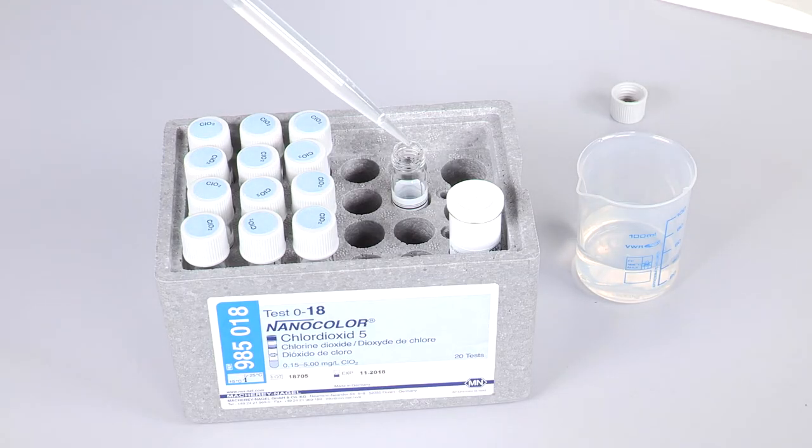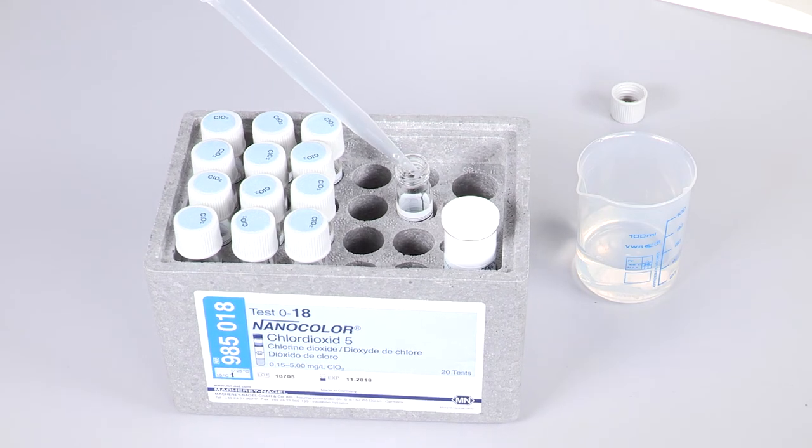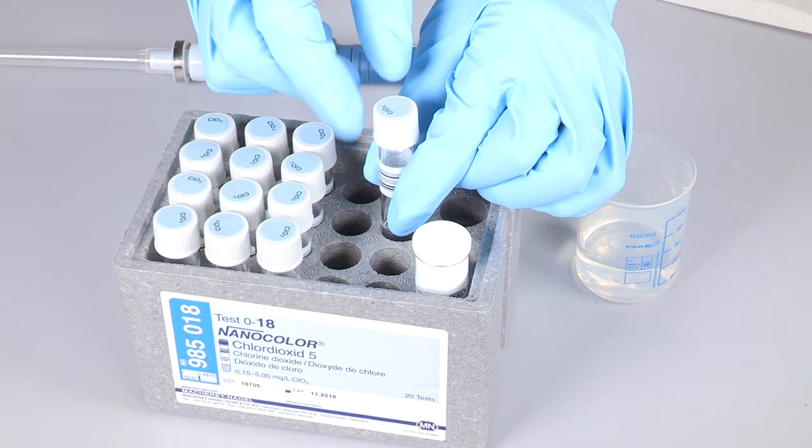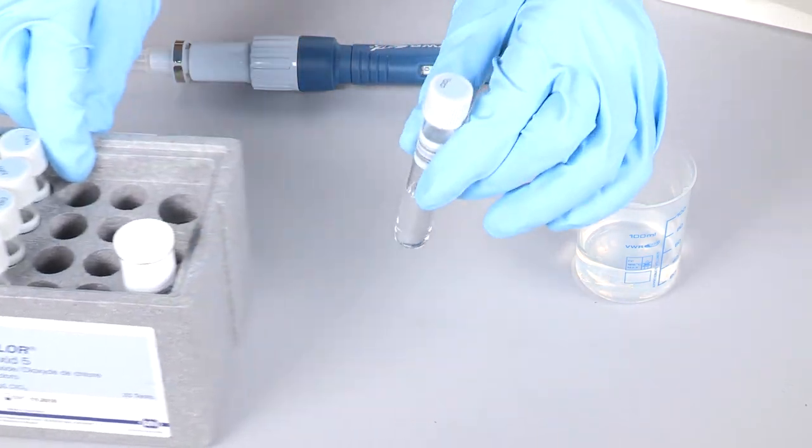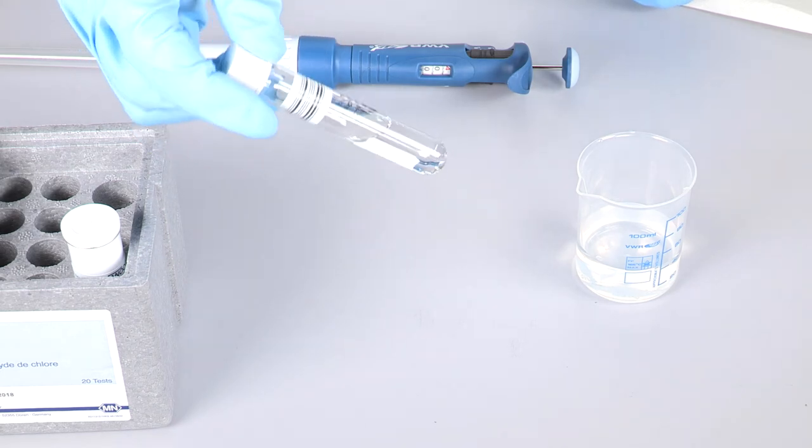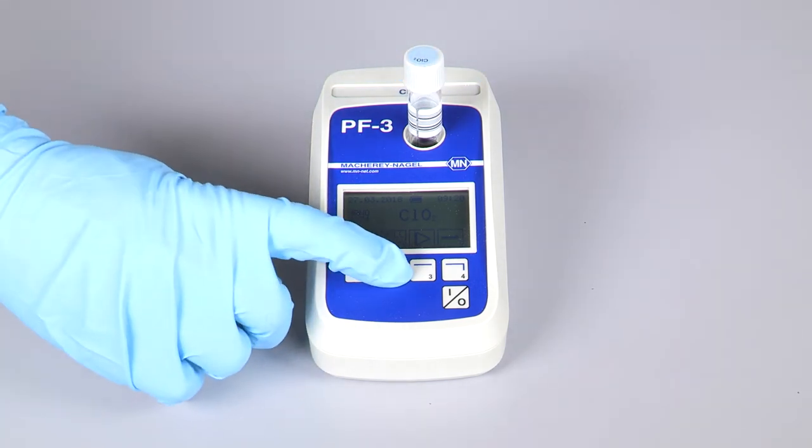First we start with a zero measurement at the photometer. For that we fill 4 ml of sample with a pipette into the cuvette and mix it. The cuvette is inserted into the photometer to perform the zero adjustment.